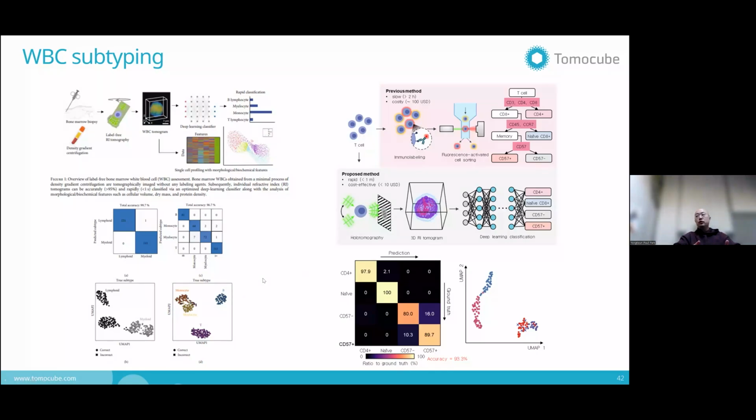So we are trying to understand the potential of cell classification by using HT and AI. We are investigating several projects in order to see what the ultimate accuracy is and what the limitations and challenges are. So this is research-level activity.